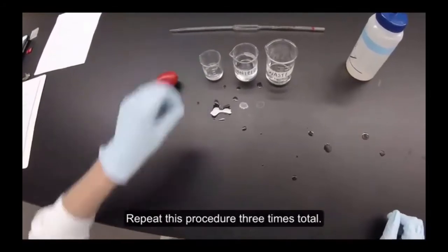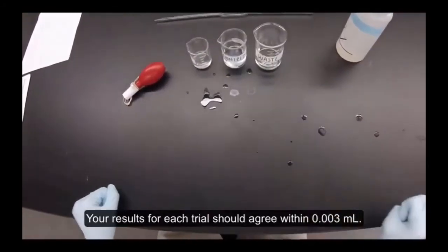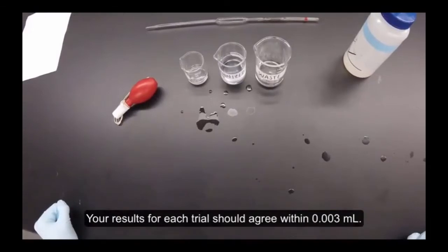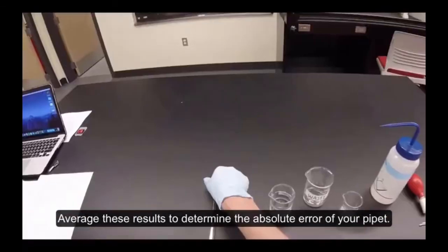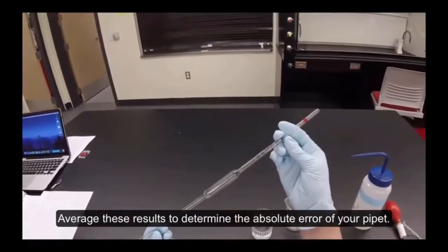Repeat this procedure 3 times total. Your results for each trial should agree within 0.003 milliliters. Average these results to determine the absolute error of your pipette.